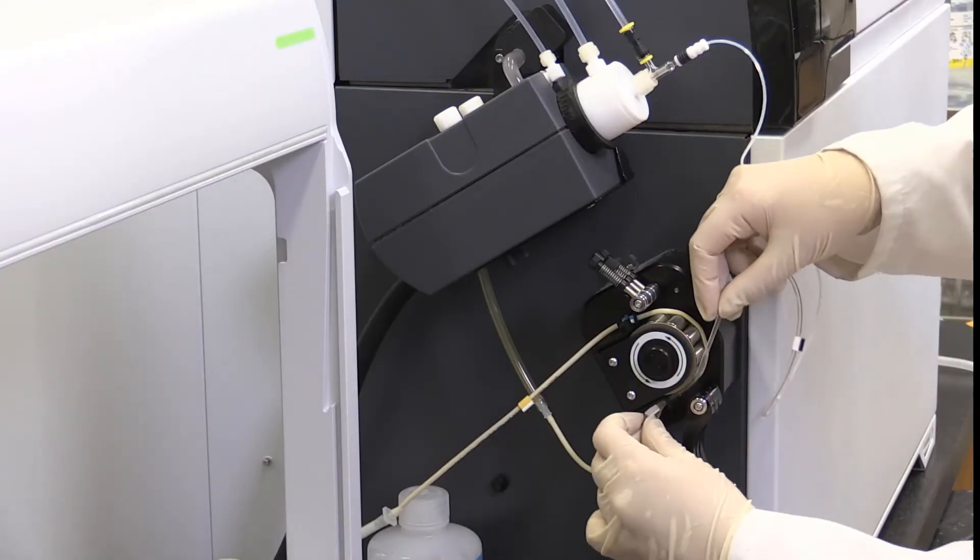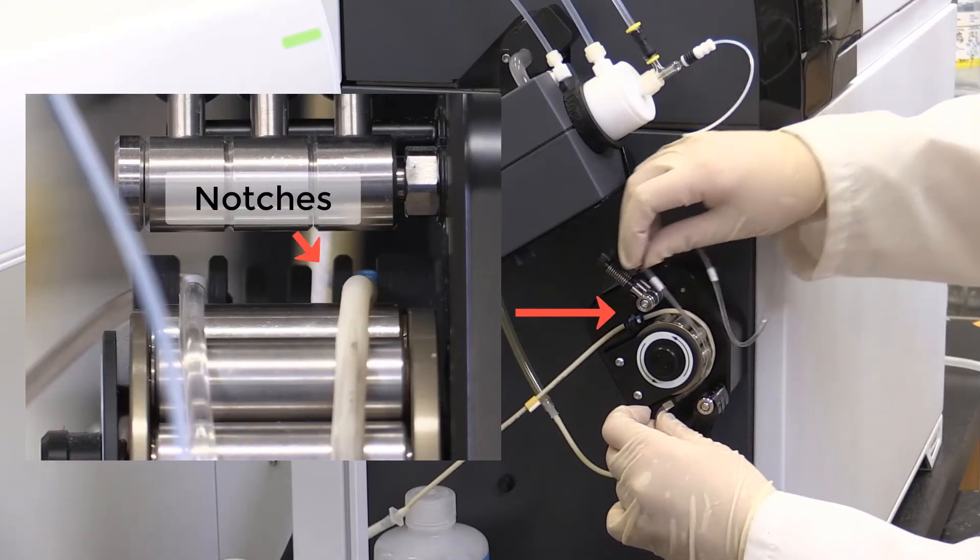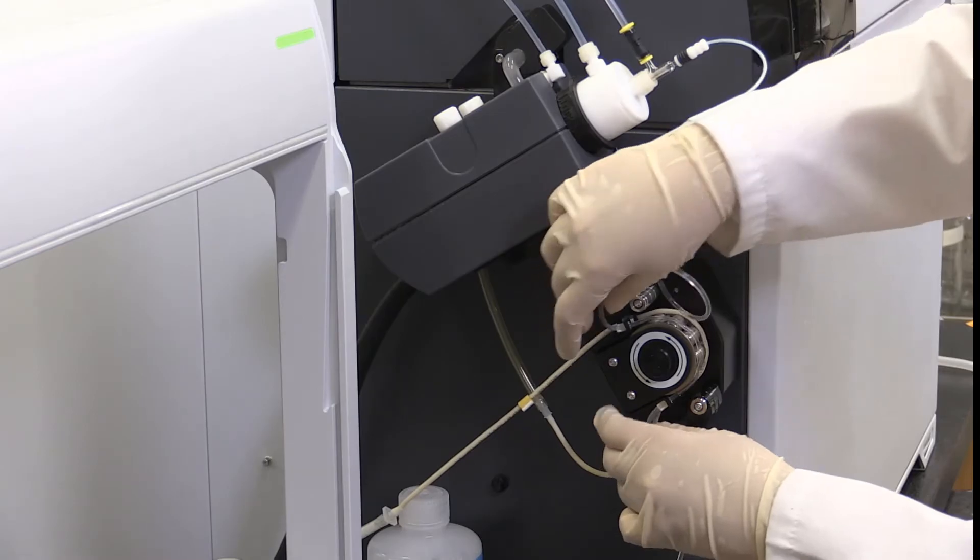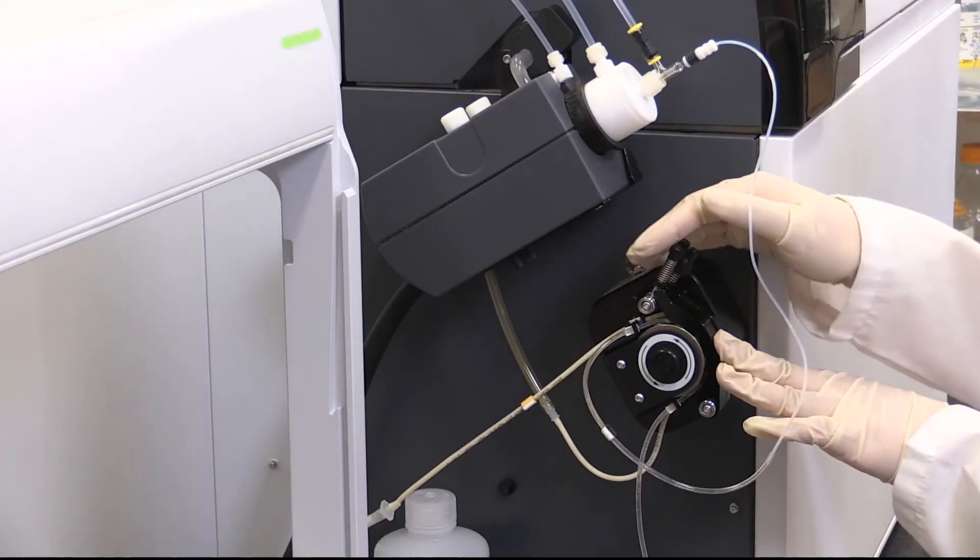When placing the tubing on the peristaltic pump, tubing is placed in the notches and plastic stops are used to keep the tubing snug. Tubing will be clamped to maintain pressure and position.